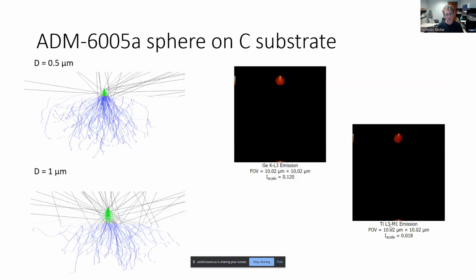So finally, one of the real advantages of Monte Carlos is that they are so good for modeling complex geometries. One of the things that's often difficult to know is, if I have a particle, what will the effect of its particle nature be on our measurements of composition? That's a question you could investigate using a Monte Carlo, as we've demonstrated here.